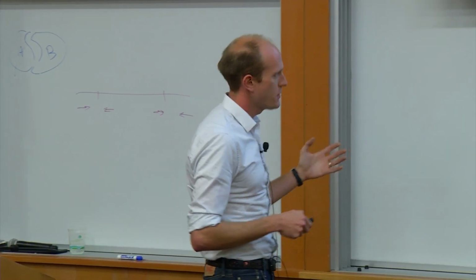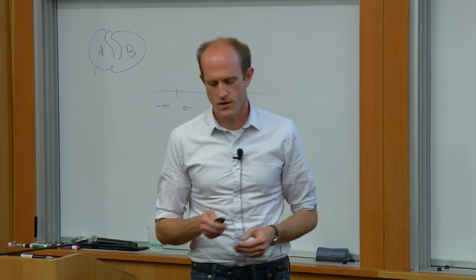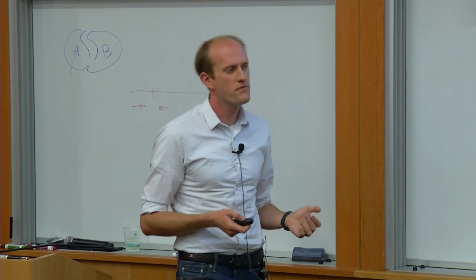Just to let you know, we're going to go through a little bit of this whole thing in detail for two of the most popular servers, and try to peel open the box and show you a little bit about how these things work, because it's not totally intuitive. All right, so how do we find guides?